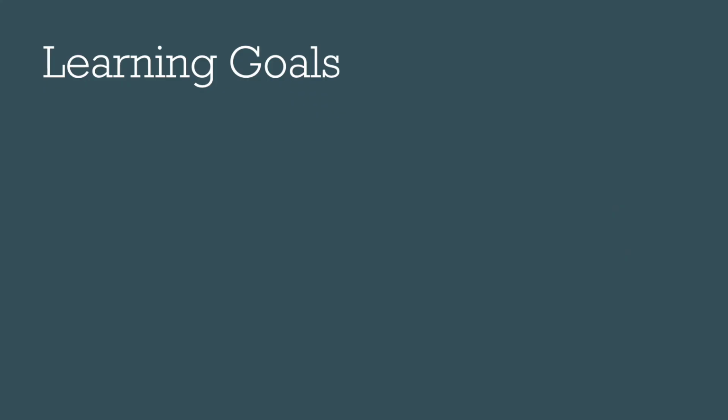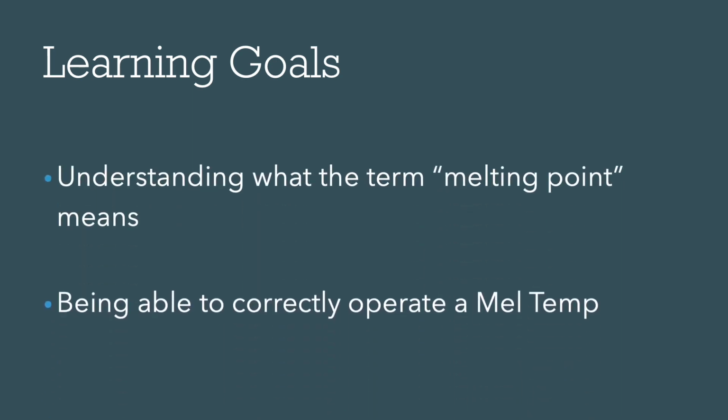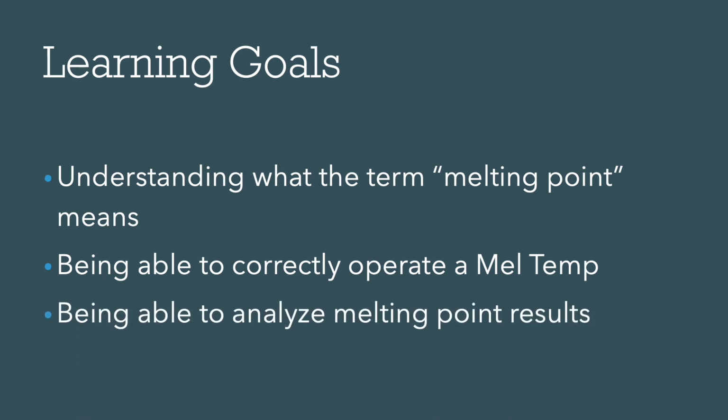As a reminder, our learning goals were to gain an understanding of what the term melting point means, being able to correctly operate a Mel Temp, and being able to analyze melting point results.